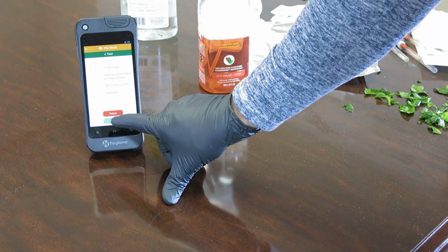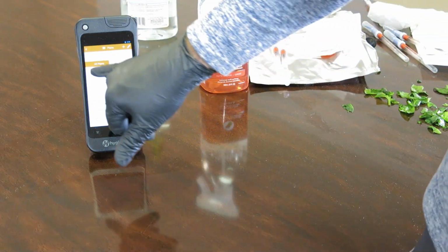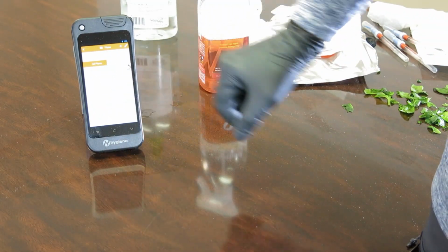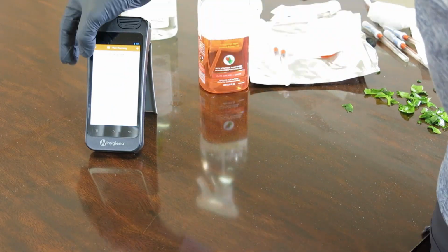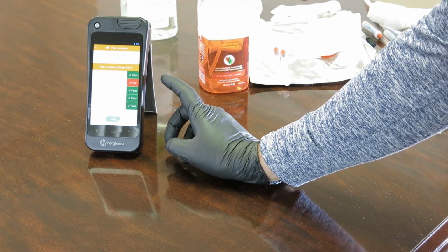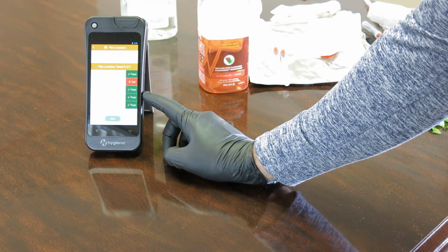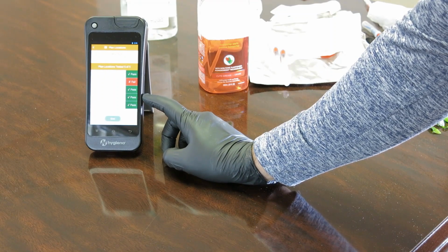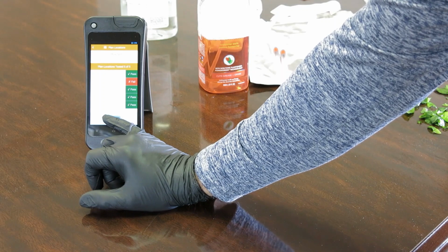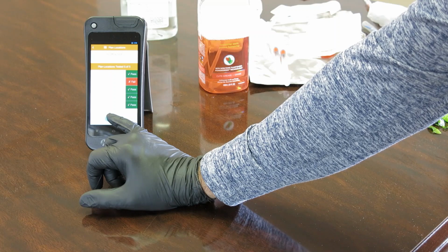So for this particular series of tests, we did our negative control, our positive control. We did a spinach treatment that originally gave us a fail, but we cleaned up and got a pass on it. Then we got a spinach post-cleaning and a negative control. So I'm pretty satisfied that this works the way it's supposed to. Hopefully we can use it well in the field.